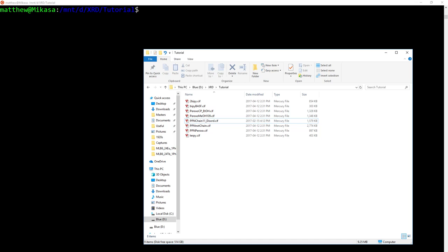If you want to have a separate block of authorship information, the CIF standard does allow that. It's how the rest of my group does things. And if you were doing that, what you would simply do is make an additional CIF file labeled, say, authorship.CIF. And to all the instructions I'm giving you, just put that as the first CIF in the line. If you're using Olex 2, all that information will be in each CIF file anyway.